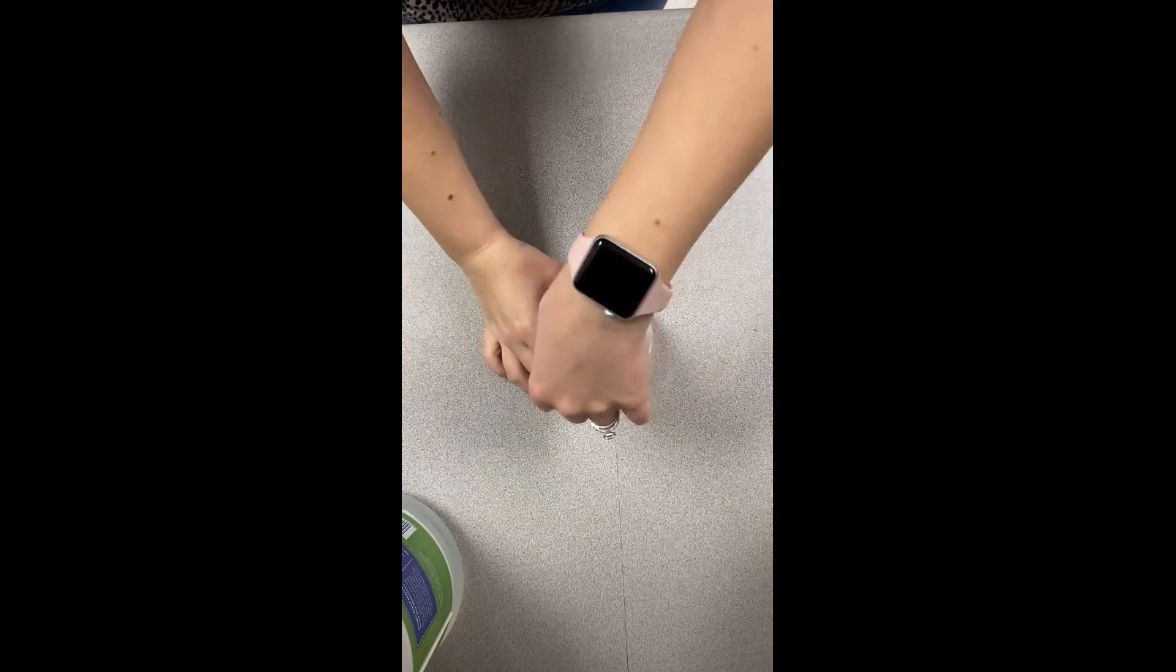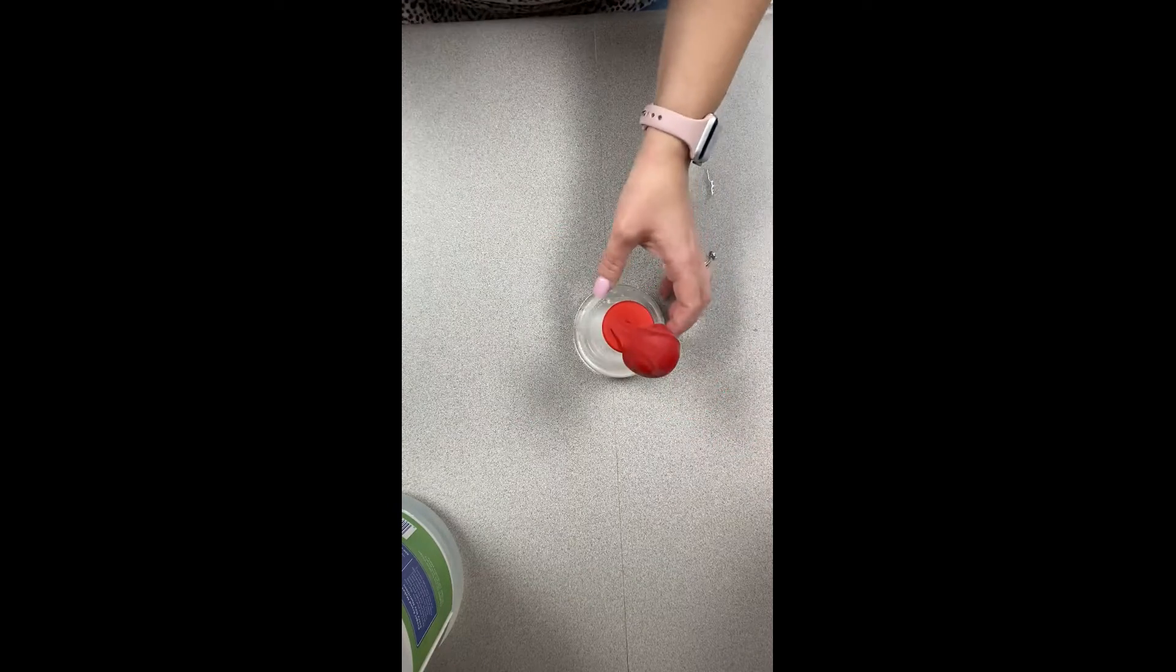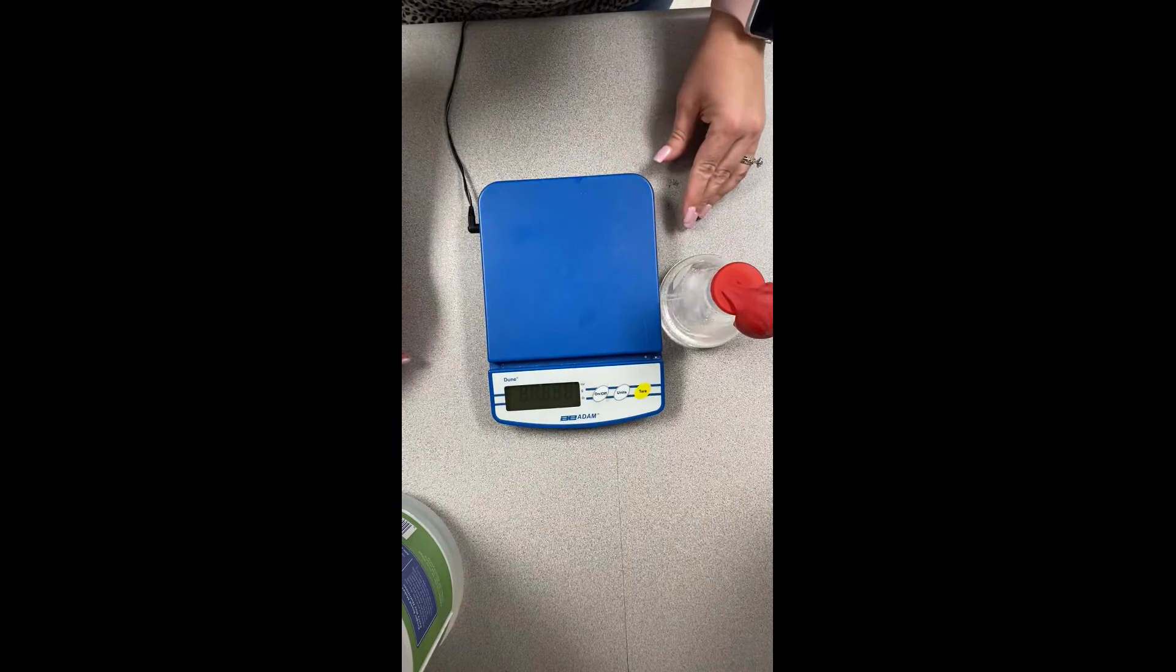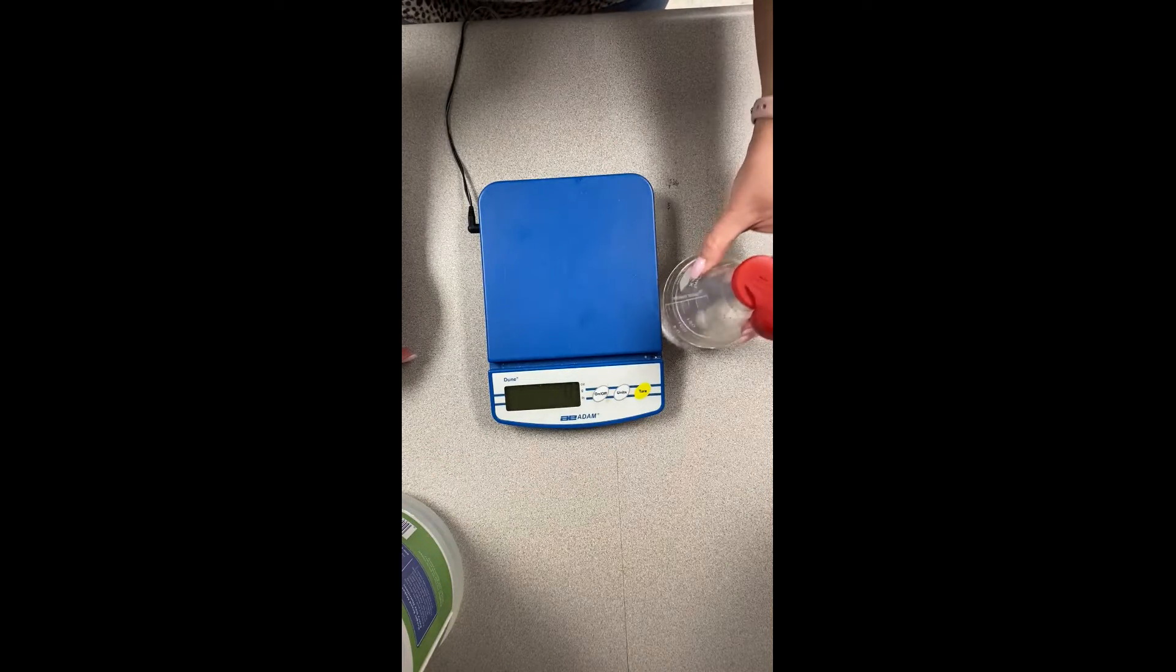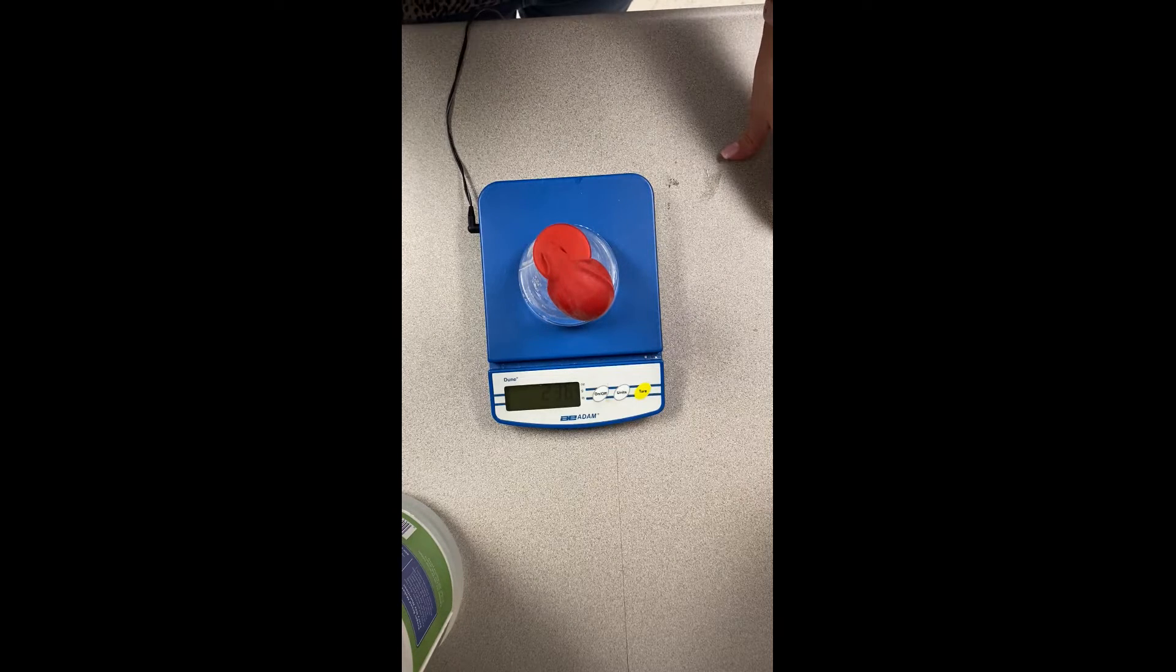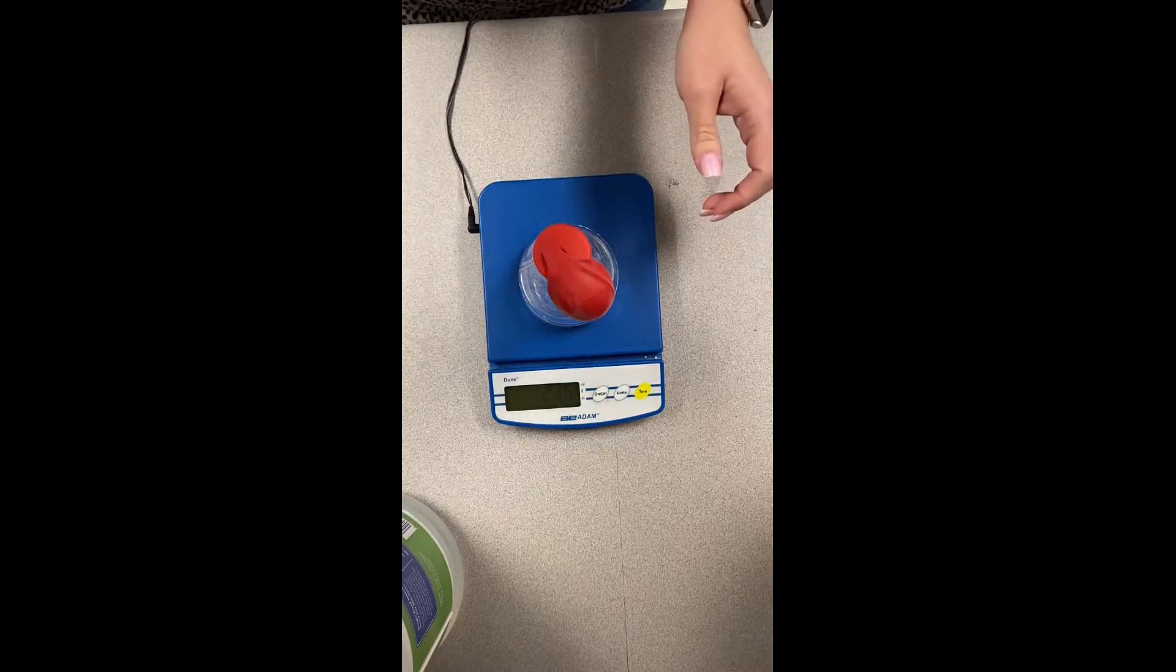Okay, we're going to start with our closed system and you can see I put a heaping spoonful of baking soda inside a balloon and put it on top of a flask that has a little bit of vinegar at the bottom. I'm going to take the mass of it now and you can see that it says 236 grams. Go ahead and put that as your initial.